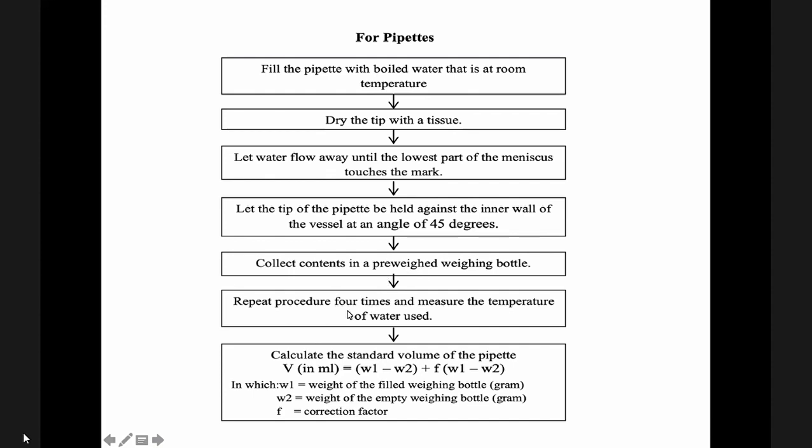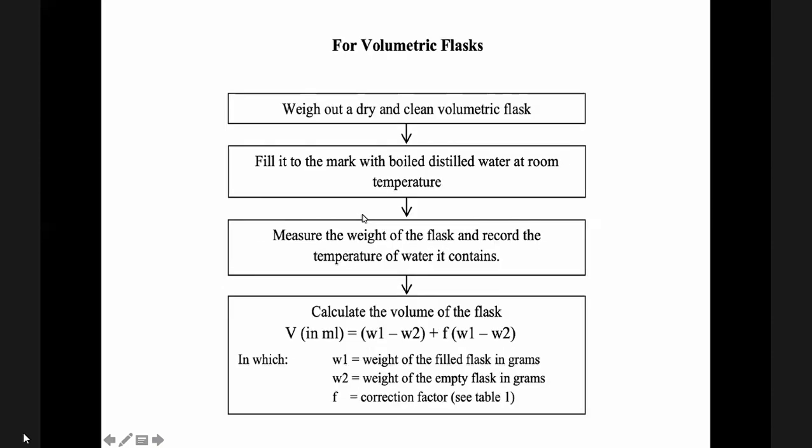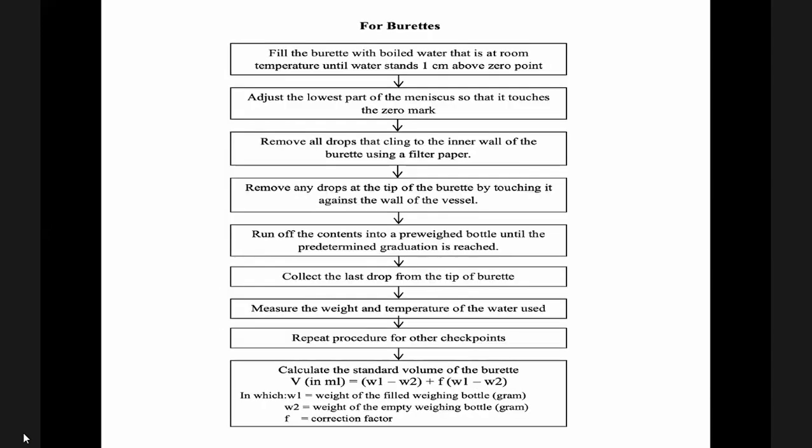Repeat procedure 4 times and measure the temperature of the water, and then you have this equation to get the standard volume of the pipette. Okay? So, nakalibrate yun na ang pipette nyo after. Next, for volumetric flask, same also, same process. And for burettes also, para hala.